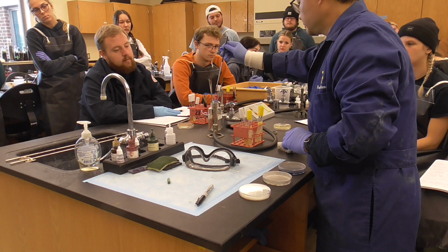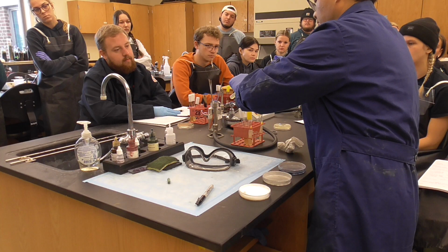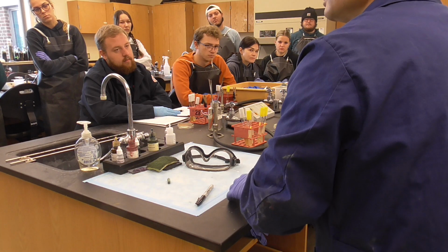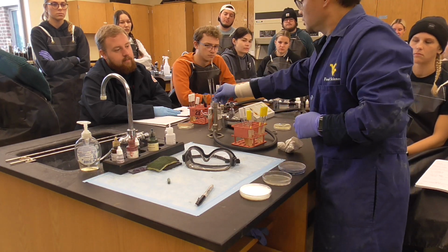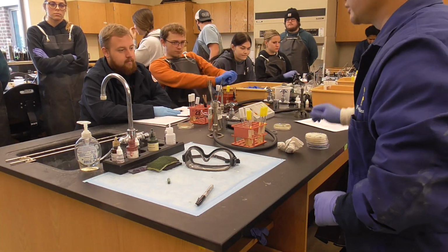Flame the loop again, and the last one. That's all, and that's finished. Then give this to you. Just keep it on your tray like this. Before you go, flip it over.